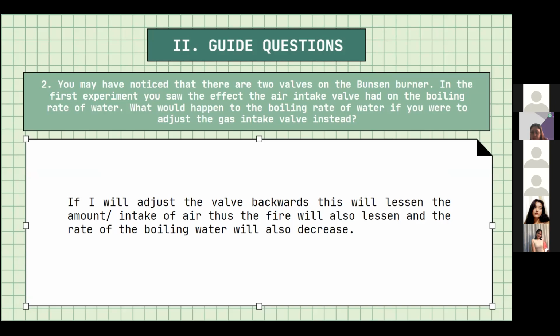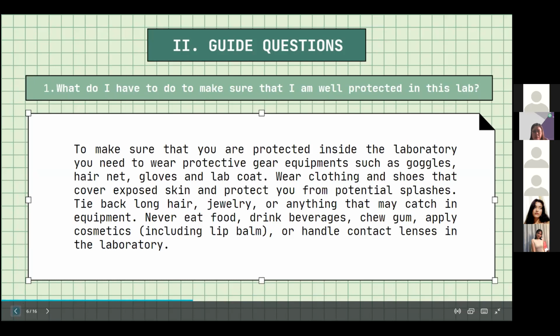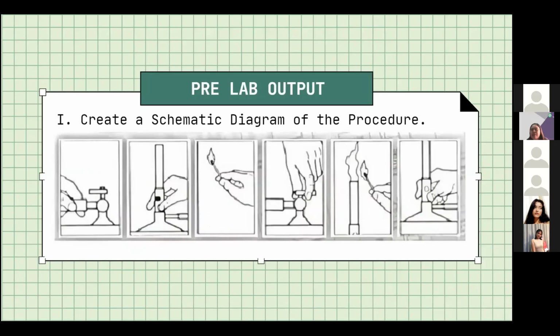So the Bunsen burner is a very important laboratory apparatus, since we have a lot of boiling and heating that we do inside the lab, and our one source of flame is the Bunsen burner. Though nowadays we have the hot plate already, we also have the alcohol lamp, but nevertheless, the Bunsen burner is still used for heating and boiling.